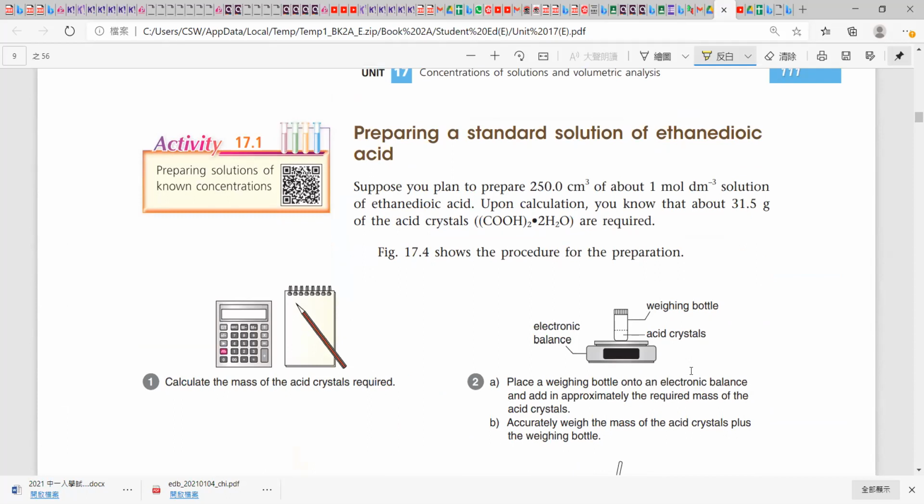So in the following minutes, I would like to show you one video to talk about the preparation of standard solution. 我哋有兩隻嘅唔同方法嘅，17.4同17點咧，其實呢度有兩隻唔同方法。第一個咧係咩咧？It is used to prepare standard solution by dissolving a salt.